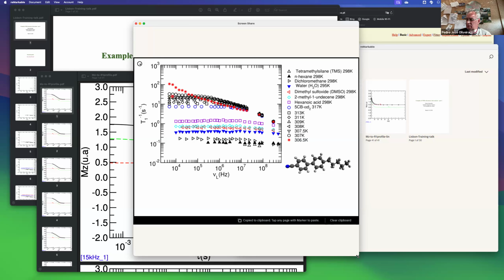So it looks flat in this area and then decreases, and the red ones are, even the curvature of the dispersion profile is slightly different, okay? There is an inflection point here. So there is a curvature here like this, and then it becomes like that. Okay, so this is 5CB, and now for the same compound, the dispersion profile can change with temperature.